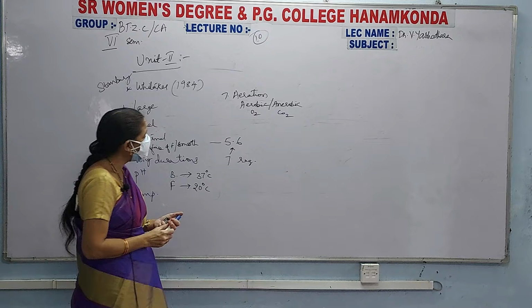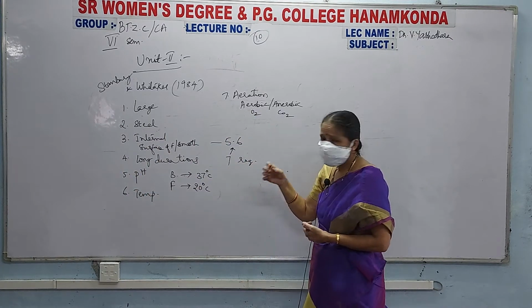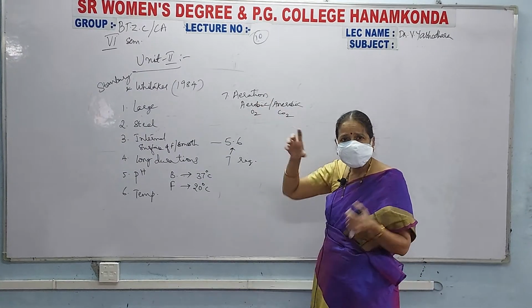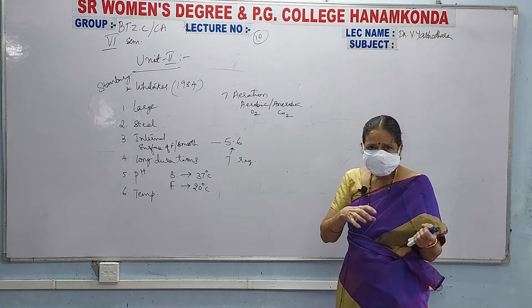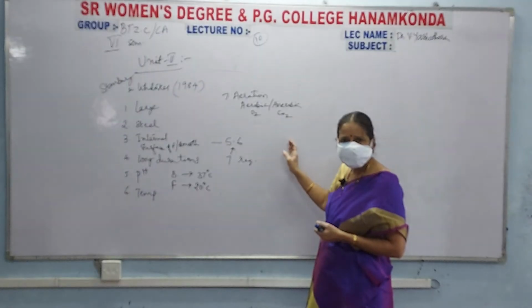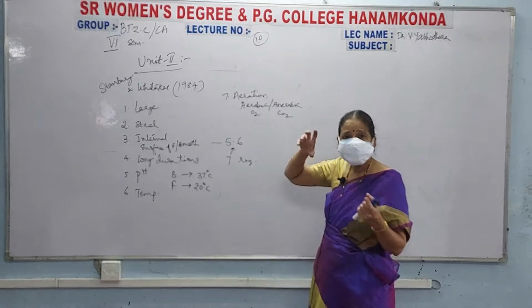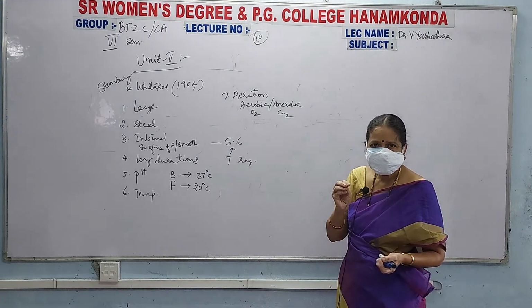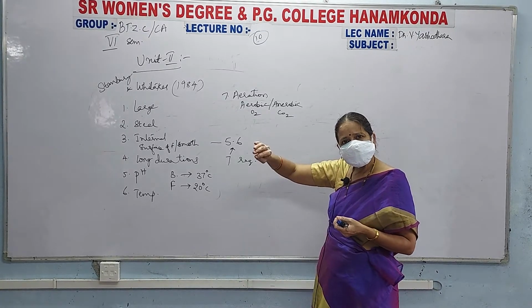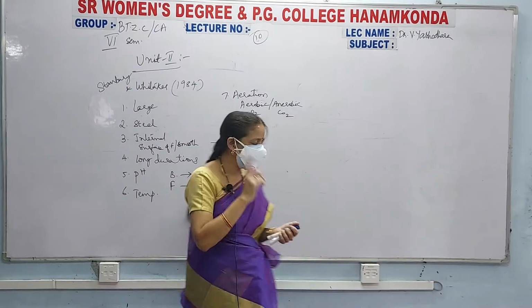So if it is aerobic or anaerobic fermentation, the fermenter should be equipped with an aeration unit, so that an air pump should be fixed, and that air pump should pump the air accordingly, that is according to the aerobic or anaerobic fermentation unit. This aeration should be supplied through the air pump. That means the air pump should allow the movement of air into the fermentation unit. That aeration unit also should be there.